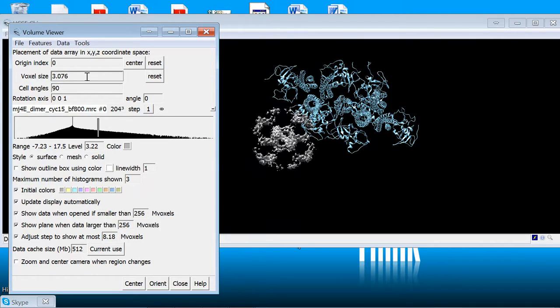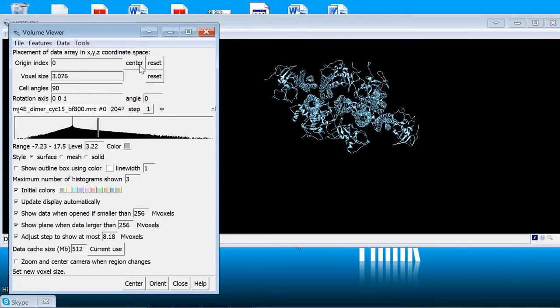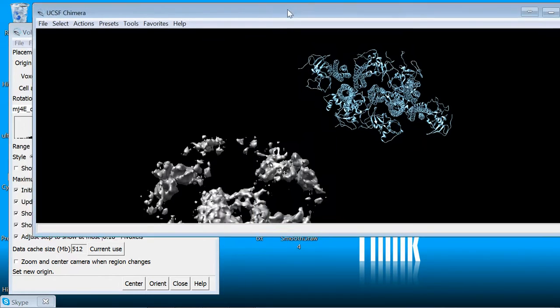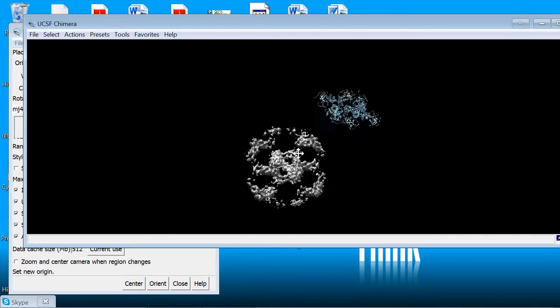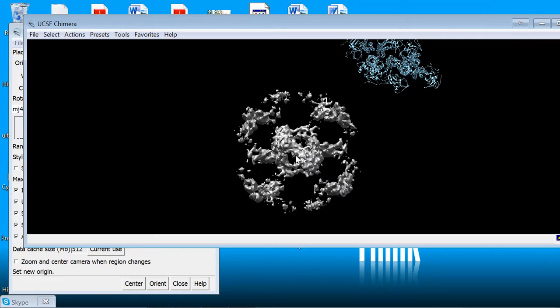So for this map it's 3.076 angstroms per pixel and hit enter and you saw the map jumped off the screen. So it's not always necessary to center it but it keeps things simple. So if you hit the center button then what it does is it changes the origin and the cell angles within the header so there's no resampling actually going on to put the map in the center of the volume.